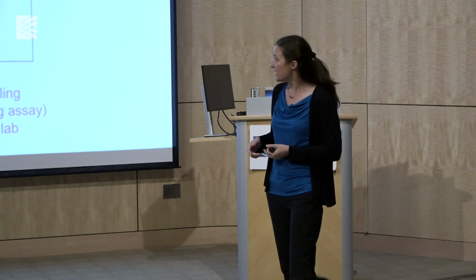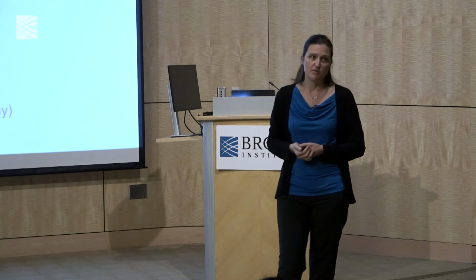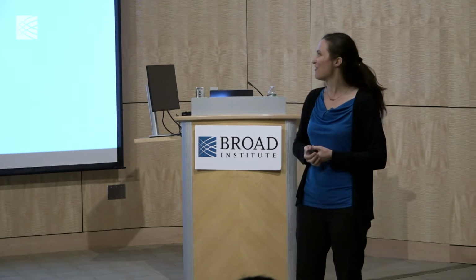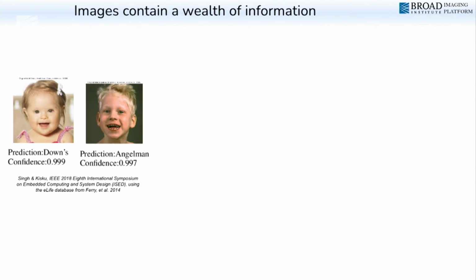And as I said, I'm going to shift now. Instead of helping biologists measure phenotypes they know that they care about already, we're going to talk about using images in a more machine learning kind of way, where we profile the sample to characterize many features of that sample, and then you compare the patterns that we see in the data to accomplish various tasks in drug discovery. And there's all kinds of different applications. We'll just touch on a few of them, but we've left a lot of time for questions, so we're happy to elaborate on anything.